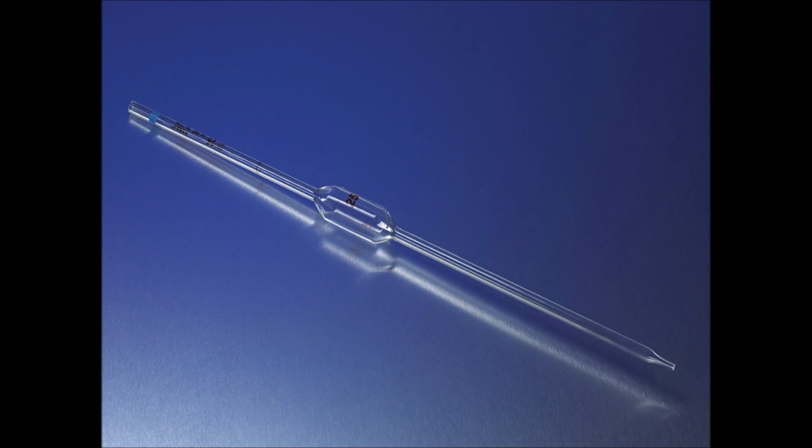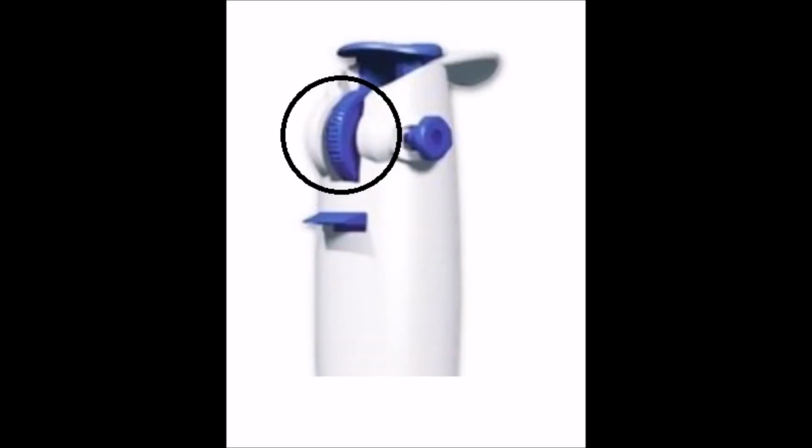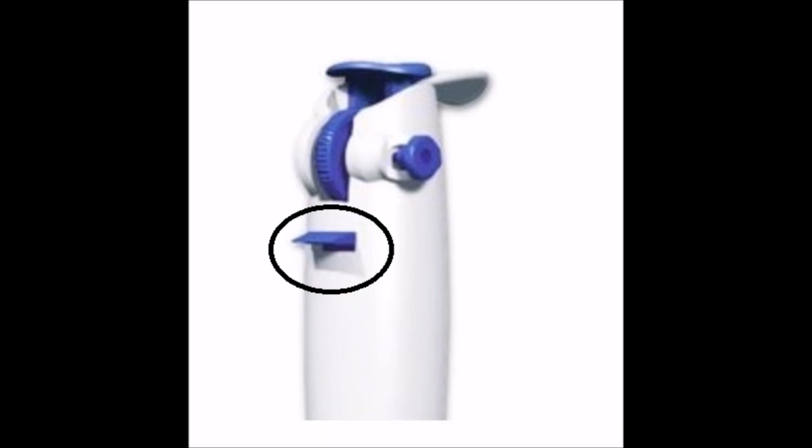The pipette shown here will allow you to accurately deliver a 25 ml volume of liquid as indicated on the side of the bulb. Here you can see a pipette filler similar to the one you will use in the labs. As you gently roll this wheel with your thumb, you will draw liquid into the pipette. By depressing this button under the wheel, you can release liquid from the pipette.